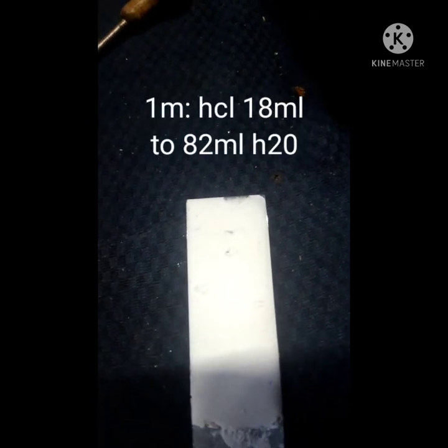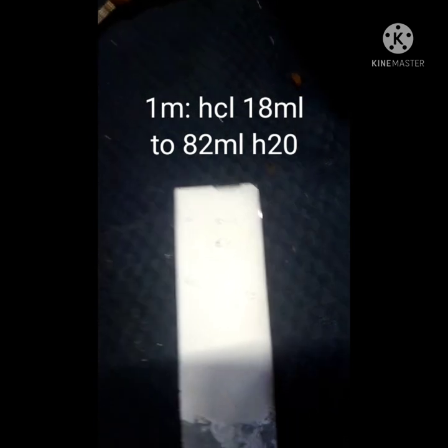One thing to note: when I spotted plates one and three, my dots weren't on an exact straight line, so spot one started slightly below spot three, which is why those two traveled the same distance. For spot two, the RF value is right where it should be, and that makes me happy. This proves that hydrochloric acid and methanol can remove the NBOK group from a protected amine — I successfully deprotected it, which is exactly what I was trying to do.